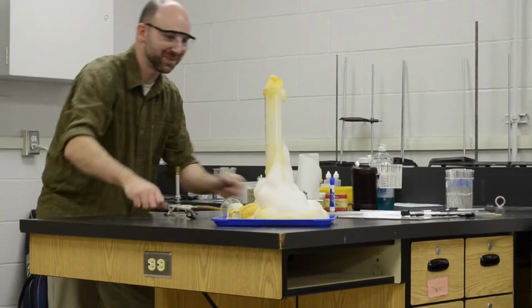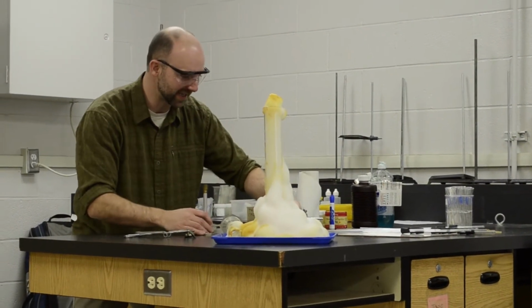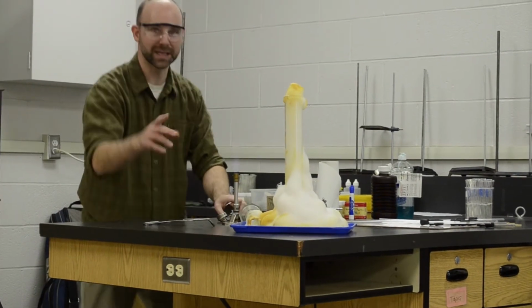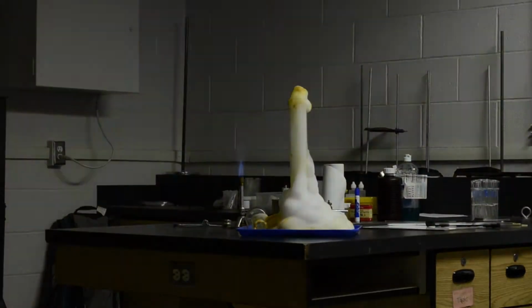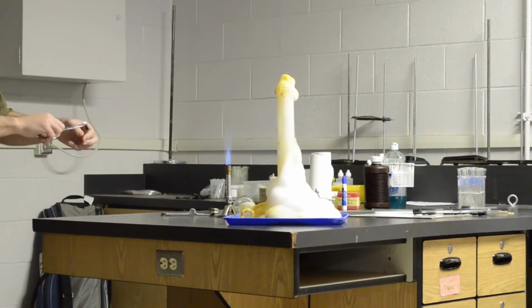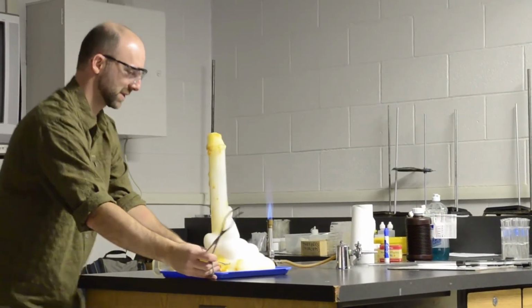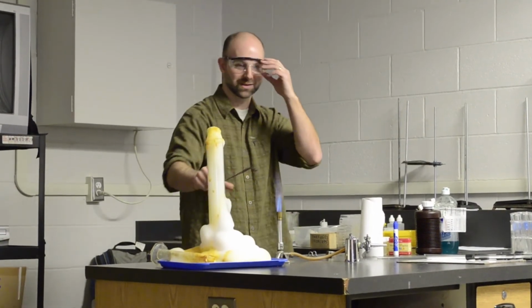Again, like I said, this might be the last thing I ever do. I don't think it'll explode on me. I don't have any gas in a confined space, but it could burn brightly. Okay, I won't look at it. You shouldn't either. I'll turn off the lights though. Okay, here we go. Remember, it goes like a bright flash. I'm going to ignite this and then I'm going to drop it in there. And we'll just see what happens. Again, if it starts burning, you don't want to look right at it.